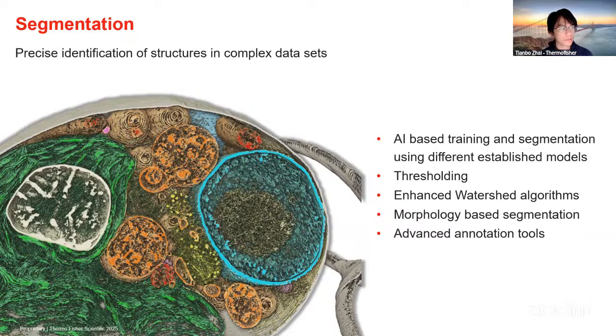Without a reasonable segmentation, there's no way that we can extract any meaningful statistics. So this is a lot of emphasis on the image analysis workflow in case you haven't done it. But for those of you who are familiar with it, you would already know that segmentation is such an important and critical step.